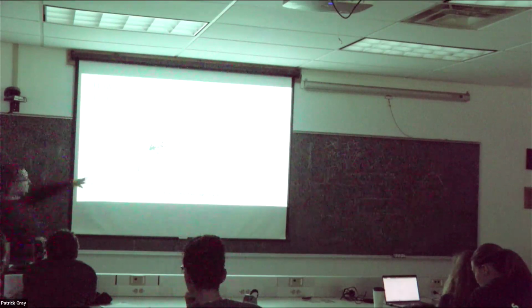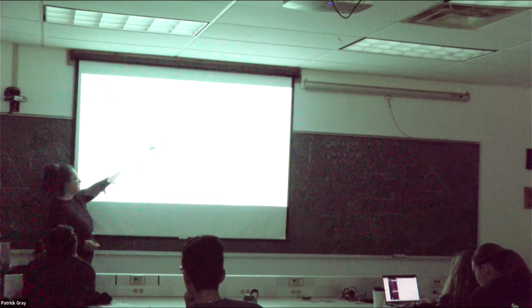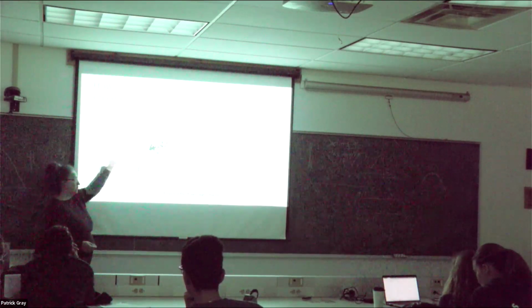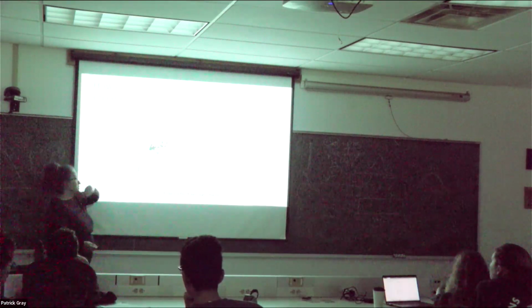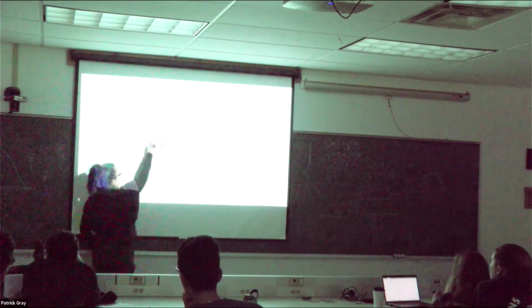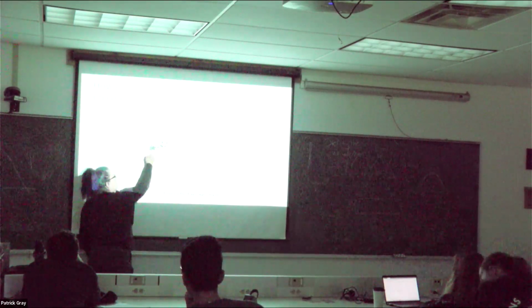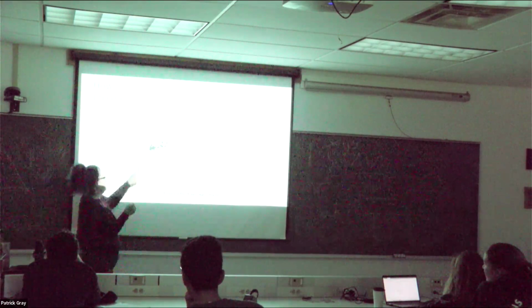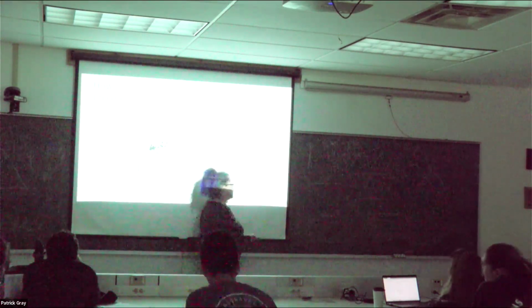individually. What the authors have done here is compare how the fluorometrically measured chlorophyll compares to the HPLC-measured chlorophyll. And they have found a relatively good comparison. Here you have from 0.2 to minus 0.2, a good comparison. So this is the difference as a function of the average.